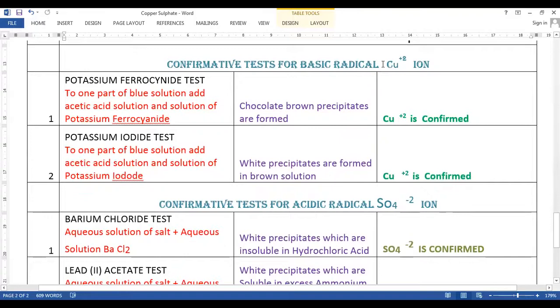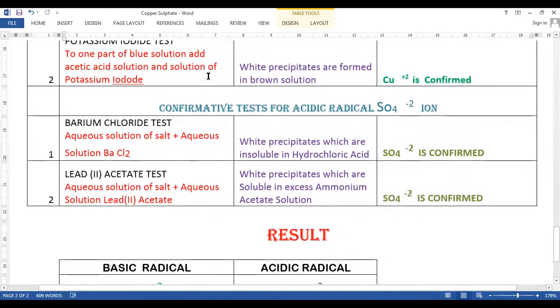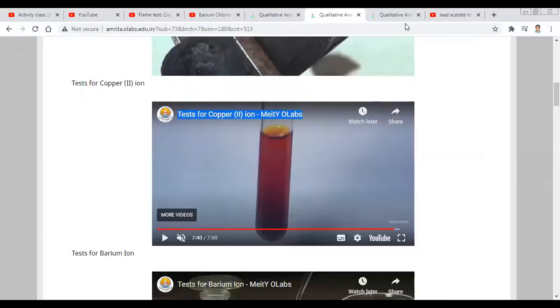So this is what we have for the confirmation of Cu²⁺ ion. Potassium ferrocyanide test: to one part of the blue solution add acetic acid and potassium ferrocyanide solution — chocolate brown precipitates are formed, confirming Cu²⁺ ion. Potassium iodide test: to one part of the blue solution add acetic acid and potassium iodide solution — white precipitates are formed in a brown solution, again confirming Cu²⁺ ion. Now we want to confirm the presence of sulphate ion SO₄²⁻. We have already seen the barium chloride test, and another test we are going to perform for the sulphate ion is the lead acetate test.